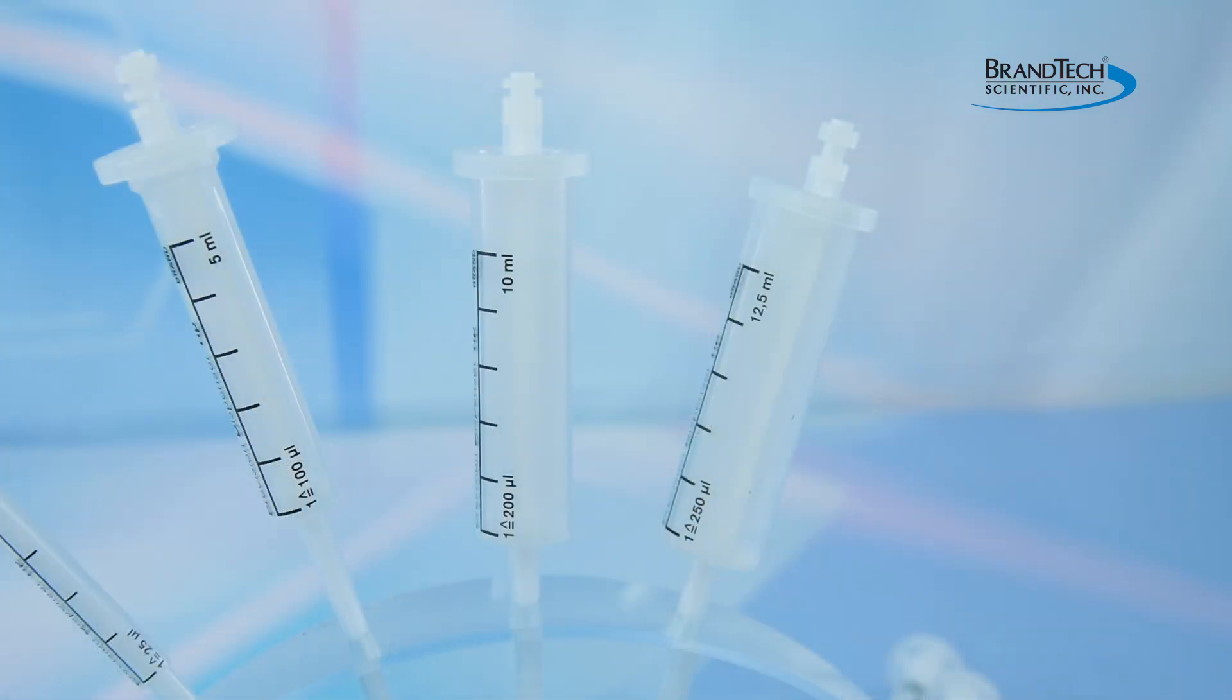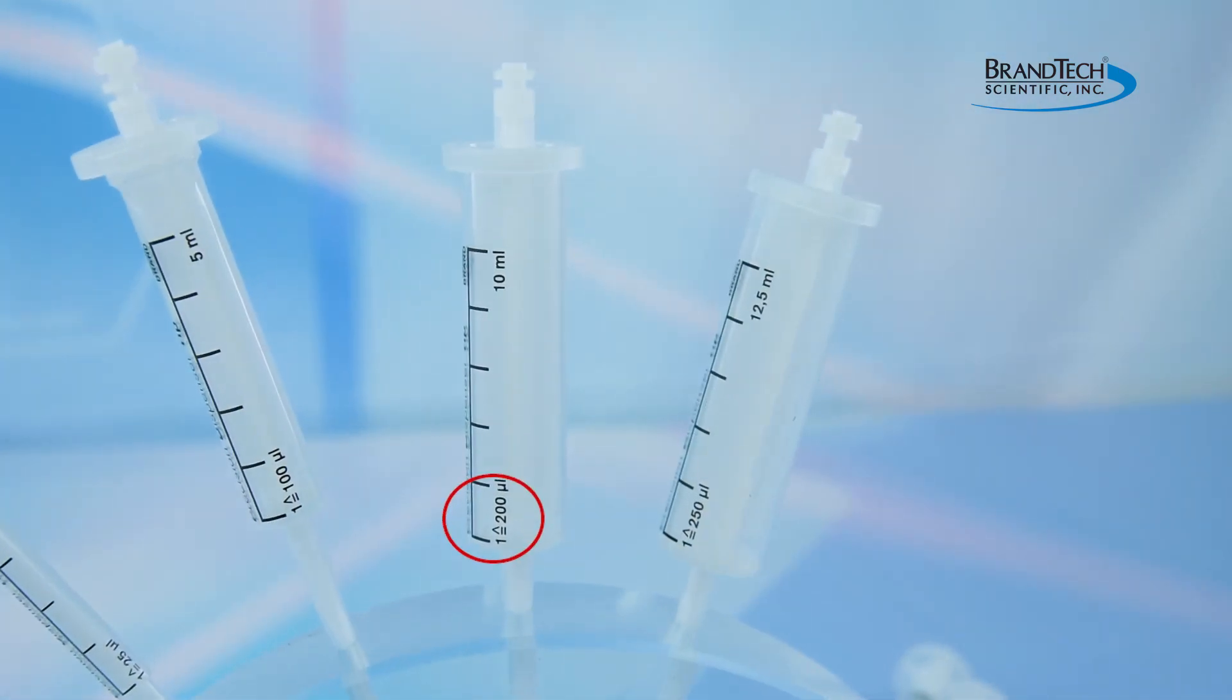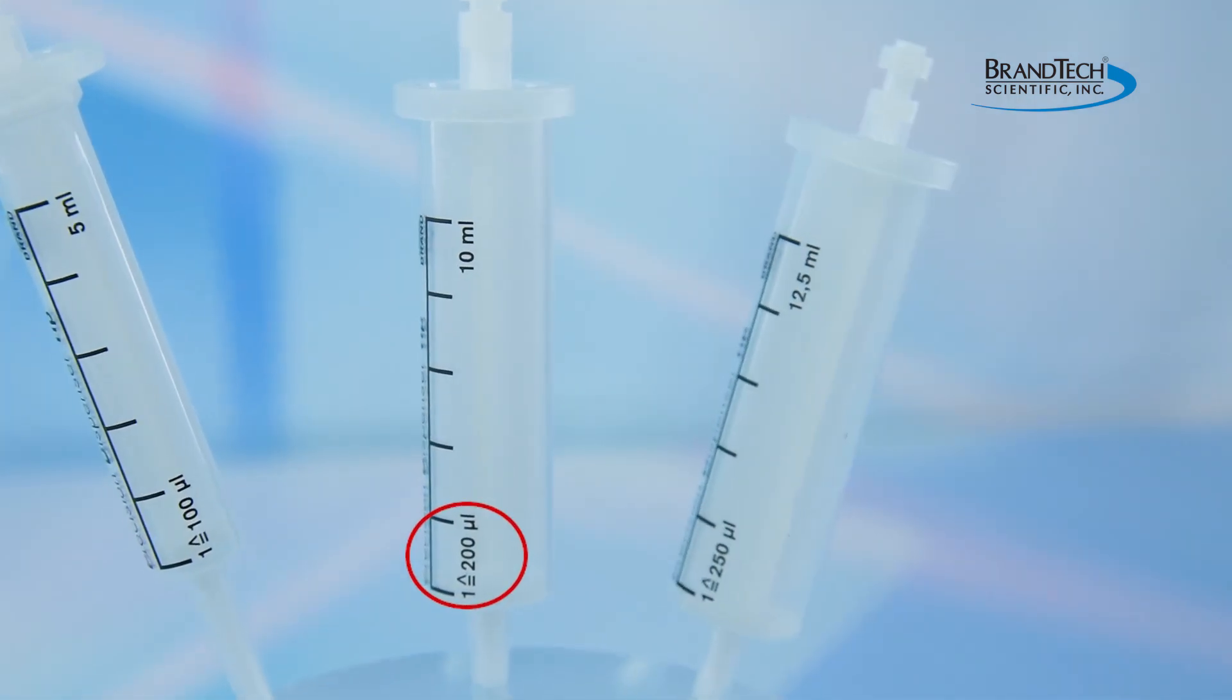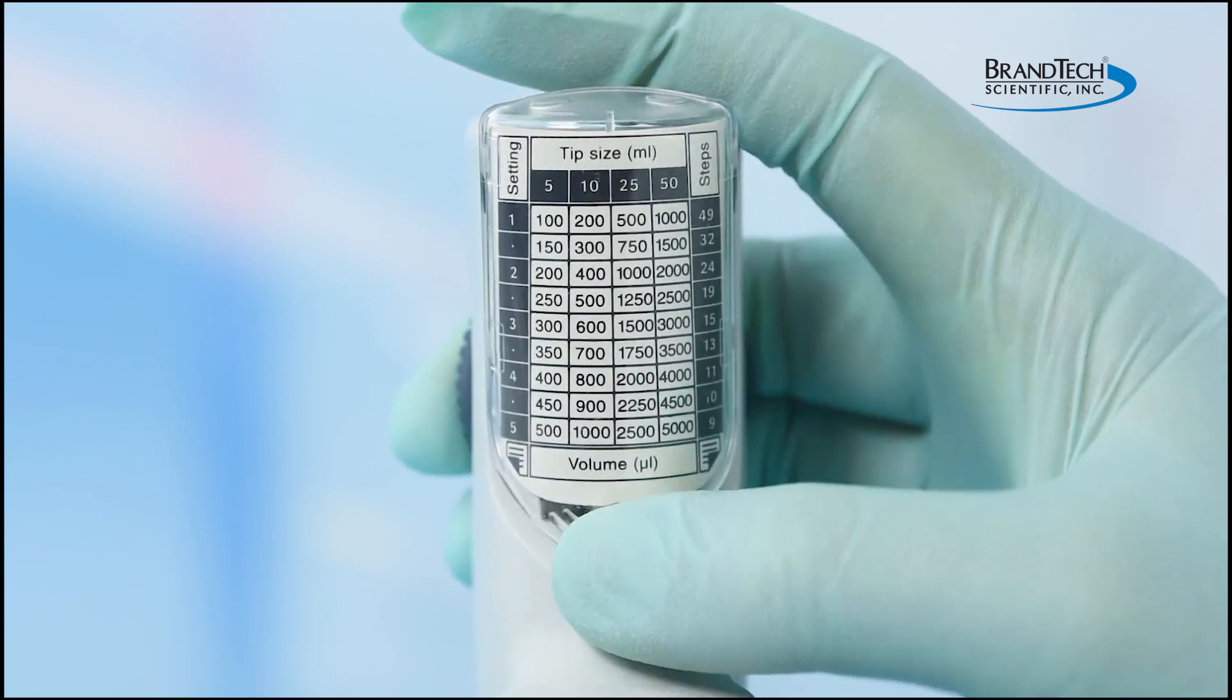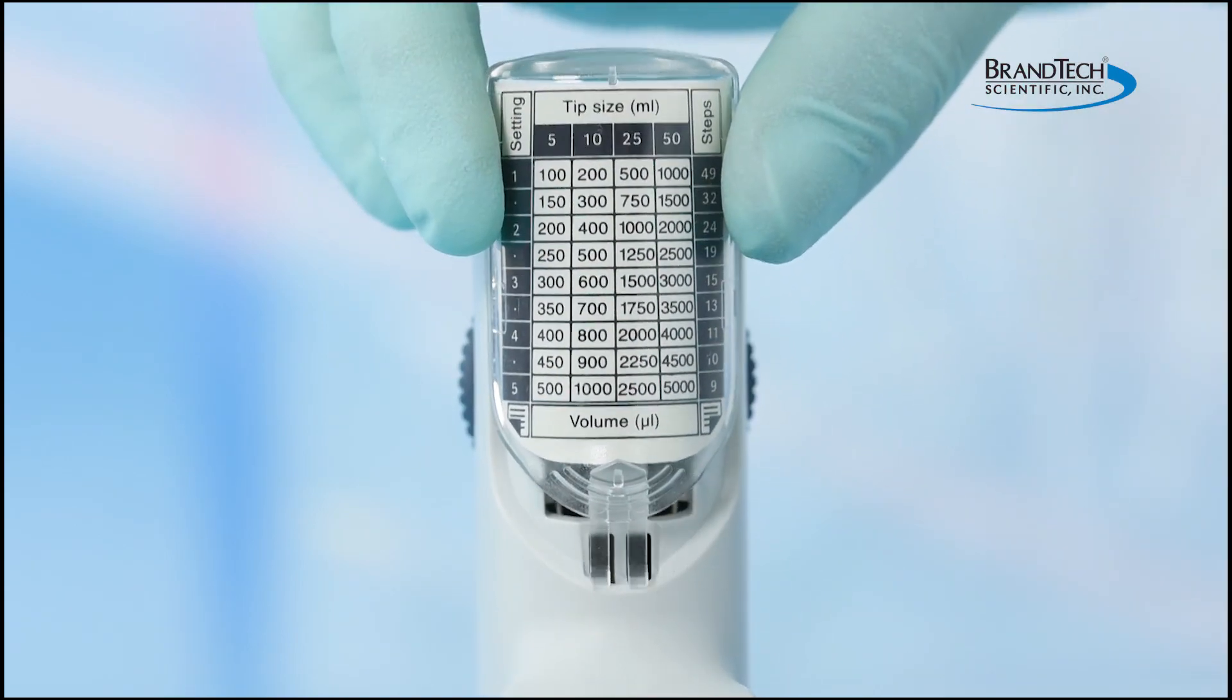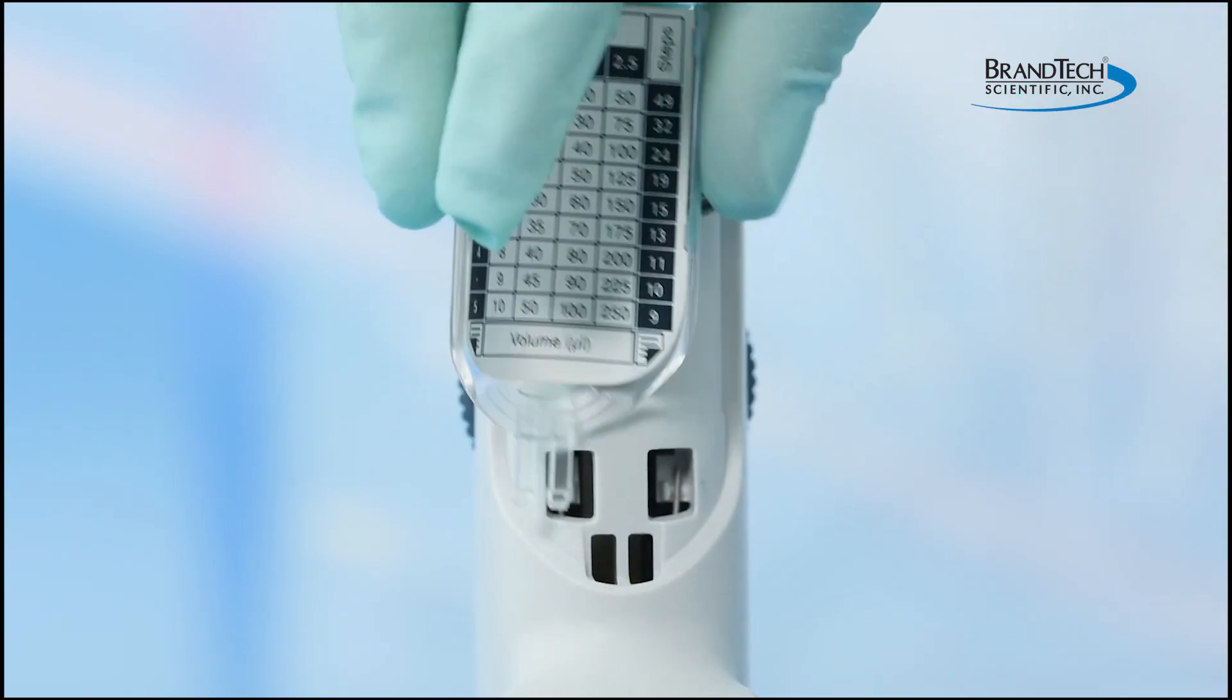To determine the volume dispensed, note the partial volume printed on the PD tip and multiply it by the settings shown on the adjustment wheel. Alternatively, a two-sided chart on the HandyStep S provides a convenient reference.